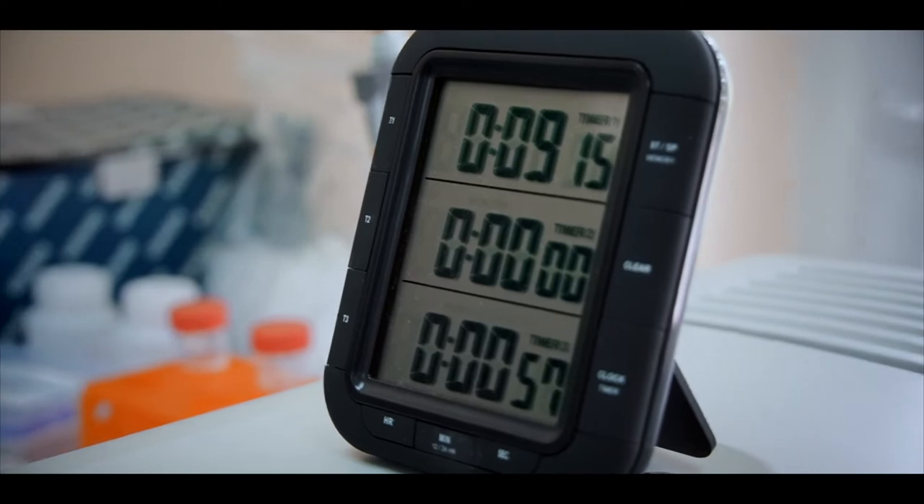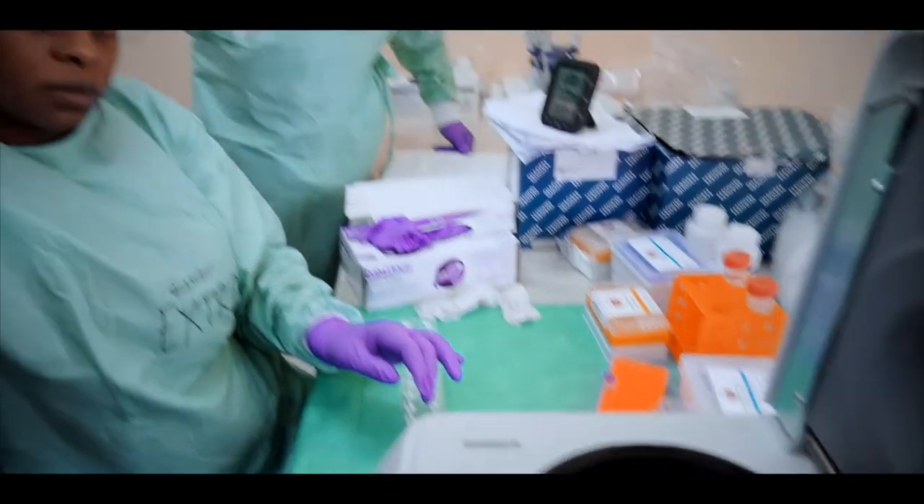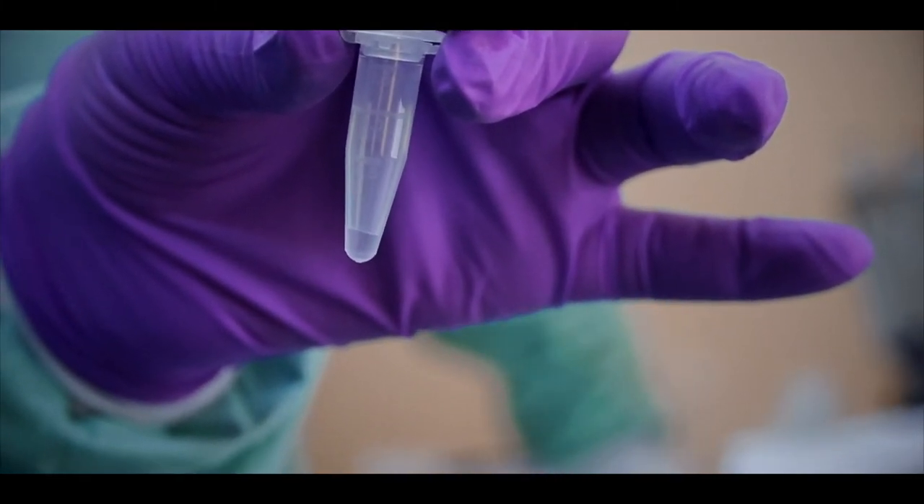The elution step is now complete and we are ready with our eluate. All the viral genetic material is at the bottom of the tube and we are ready to proceed to the next step.